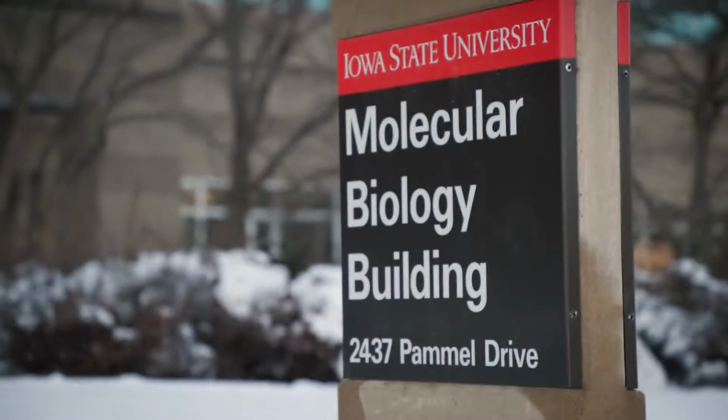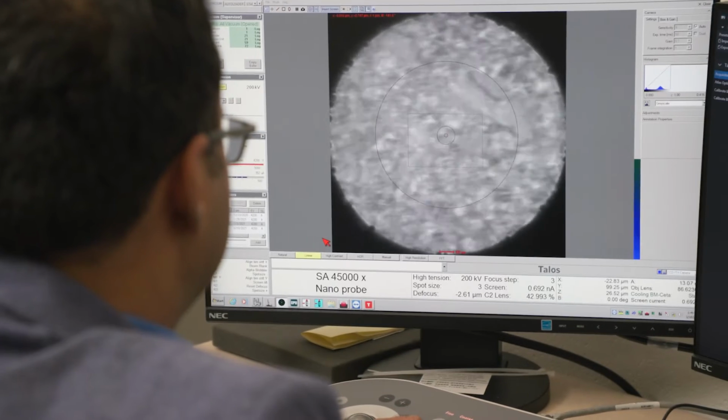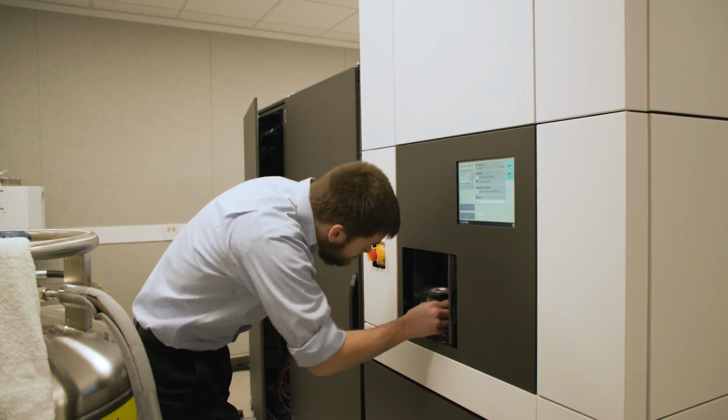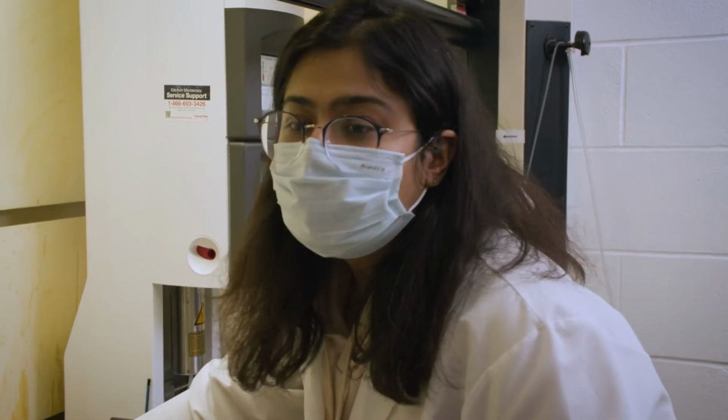The cryo-EM facility was established in 2020 with a mission to provide research infrastructure and support interdisciplinary science and structural biology. The hope with having the cryo-EM facility at Iowa State is really to do two different things. One is to allow researchers who are interested in moving into this new area of the discipline and doing structural biology to be able to do that in their labs, but also to be able to train students and postdocs in cryo-EM so that they can go get jobs in research, industry, and academics.